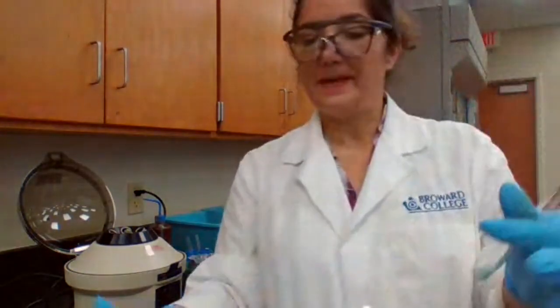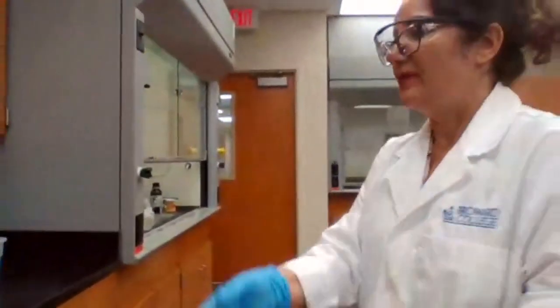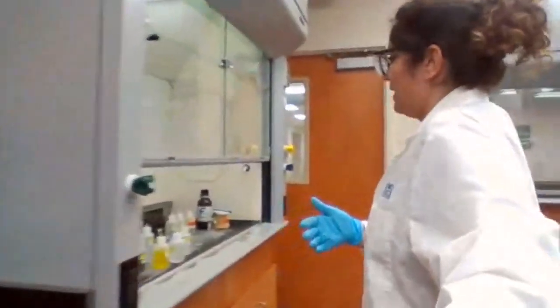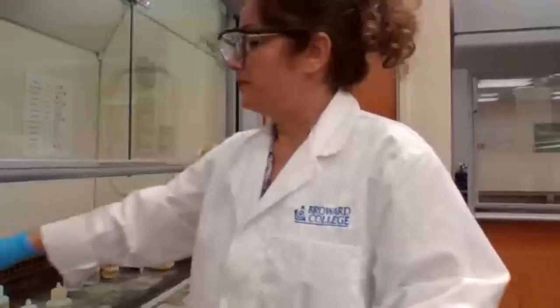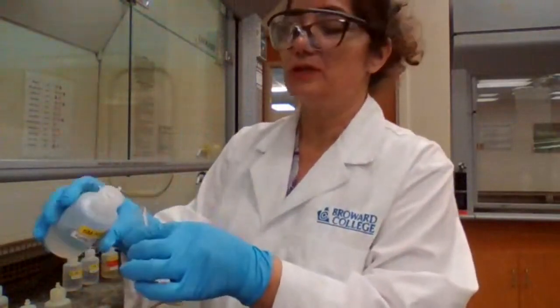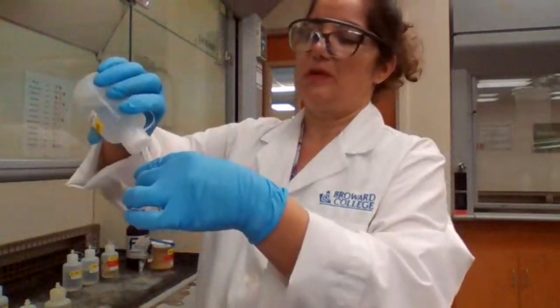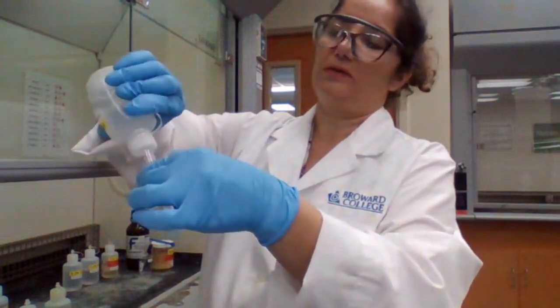So if I make this basic, it would dissolve. And when it does dissolve, I add tin chloride. If I add tin chloride, tin or Sn, it can reduce the bismuth from Bi3+ to 0, and it will give you a black color.